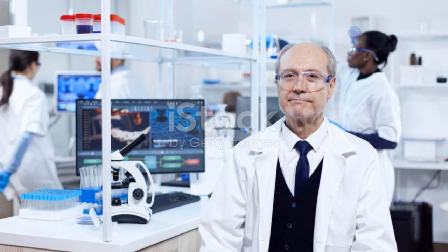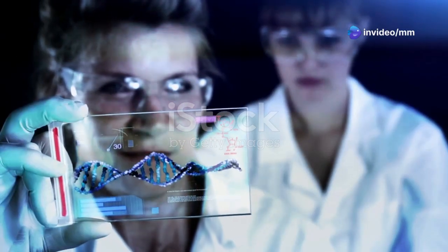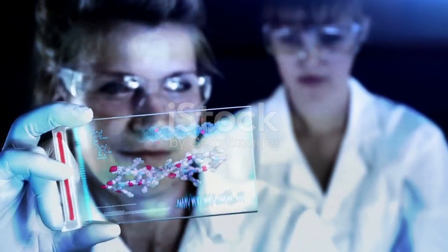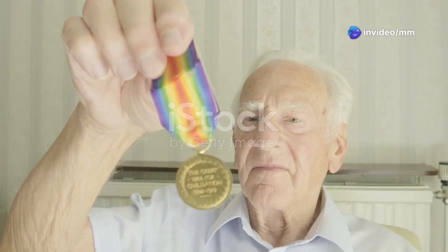One of the most significant breakthroughs in DNA sequencing came from a brilliant British biochemist named Frederick Sanger. In 1977, Sanger developed a groundbreaking technique that revolutionized the field, the chain termination method, now widely known as Sanger sequencing. This ingenious method earned him his second Nobel Prize in Chemistry in 1980, a testament to its profound impact on science.